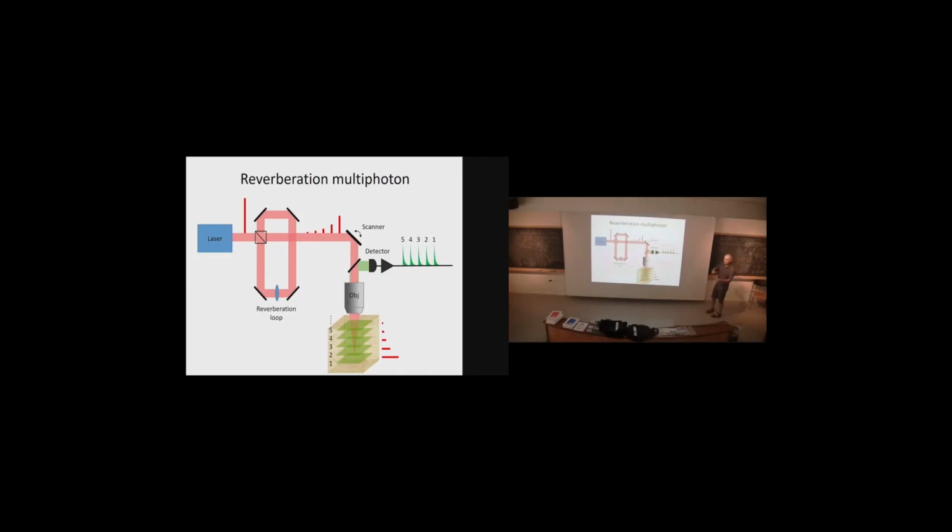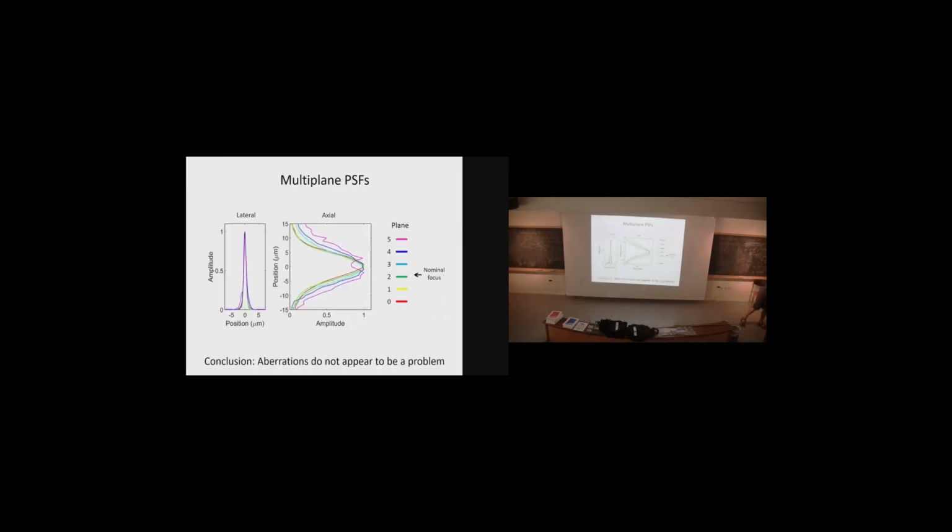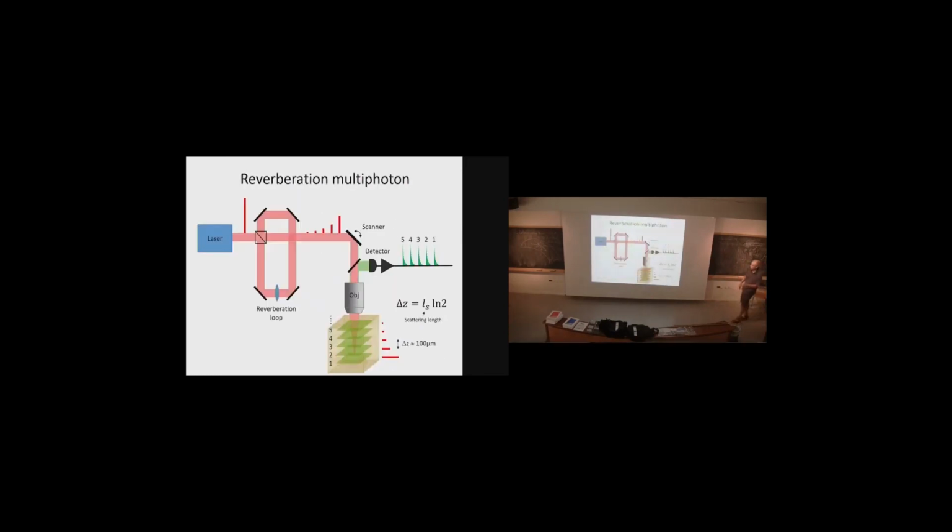So in one shot, with one pulse, it's like an extremely fast axial scan. I can scan through these layers very quickly in a single shot. And you might say, well, there's a problem with this, because I go all the way to the surface. First of all, how does this stop? You might think this keeps going, but it actually stops when the plane comes out of the sample. Eventually, the planes come out of the sample, and then I generate no fluorescence. So eventually, it's going to stop.